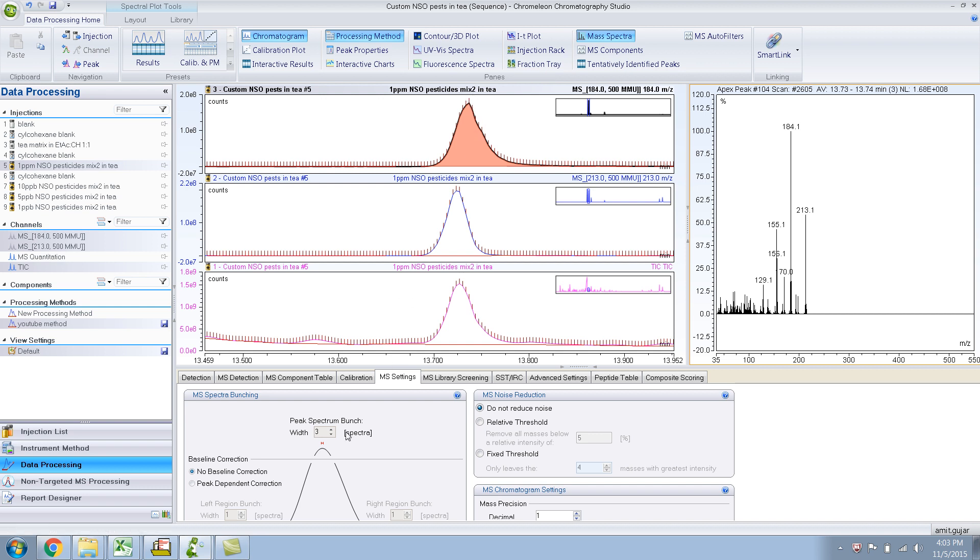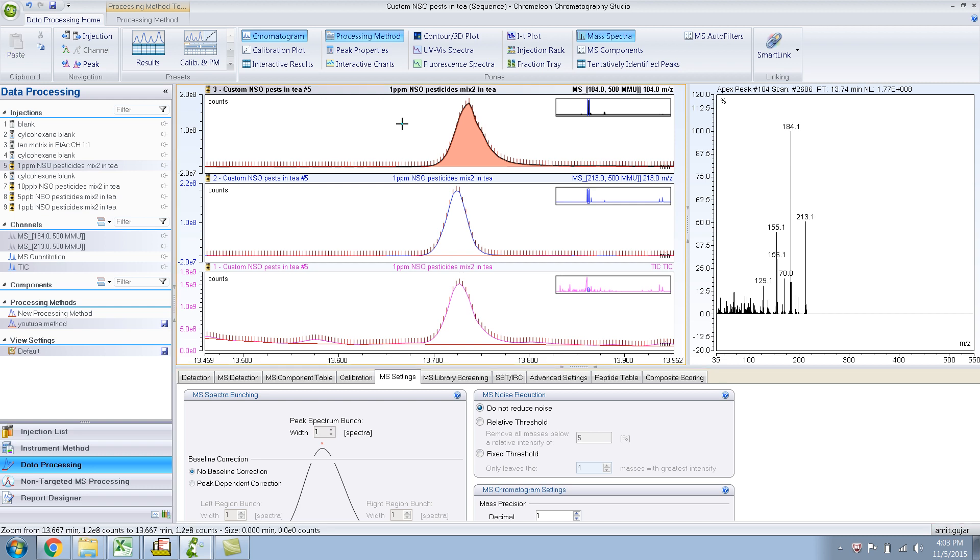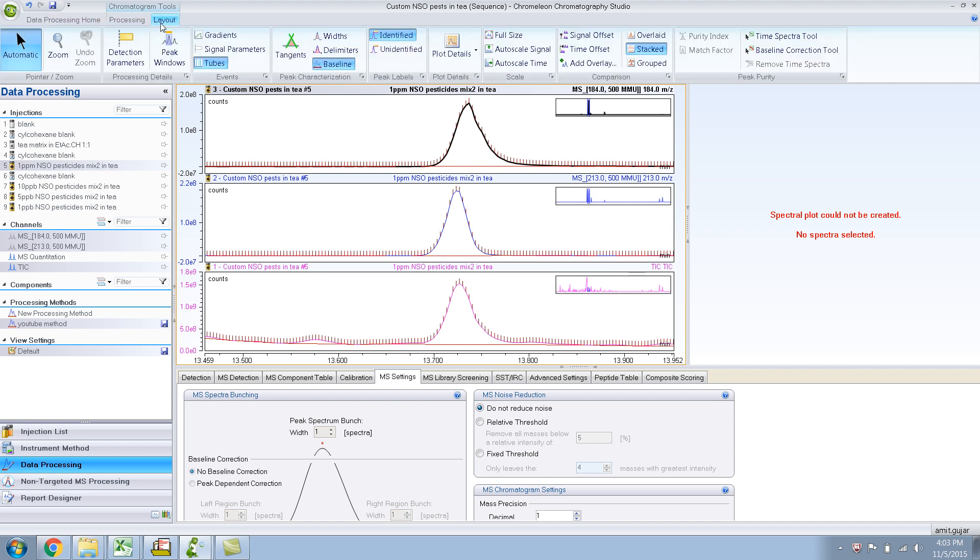So first of all, I will do just the spectrum bunch as one. Let me do this. Let me go to the layout, and let me choose this, the time spectra tool. So this is something new, right? Time spectra tool.